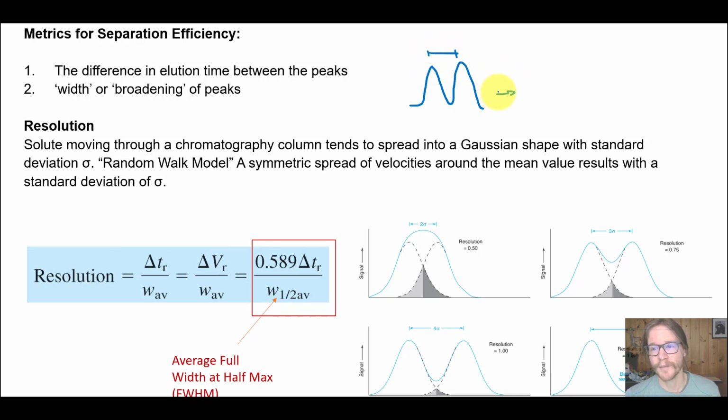Or do you have something that looks like this and you're not really sure, is that made up of two different peaks that just have such similar chemistry or physical traits, at least based on the type of chromatography you're running, that they're undifferentiable? So resolution, or the ability to resolve something, is the capacity to actually tell the difference between two points. Of course, tell the difference is a qualitative or a subjective metric, and so there's several different ways that we can do that.